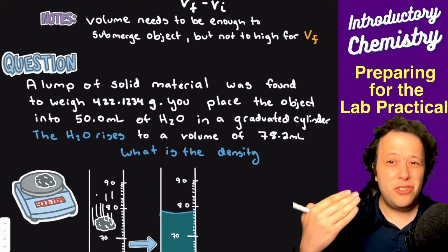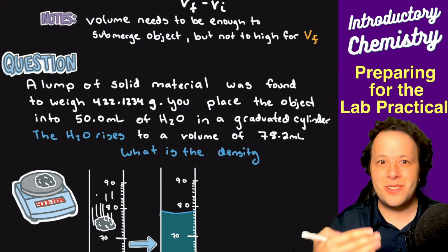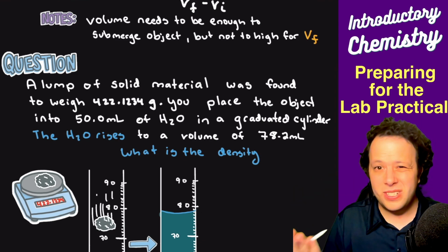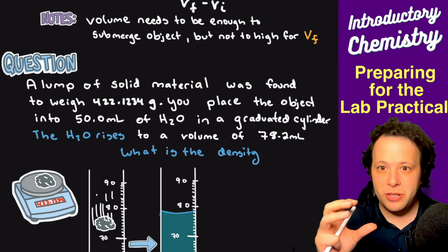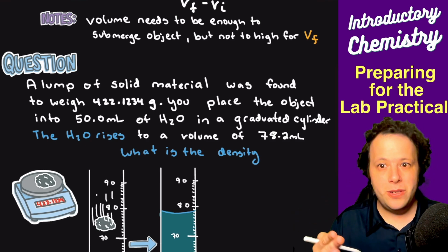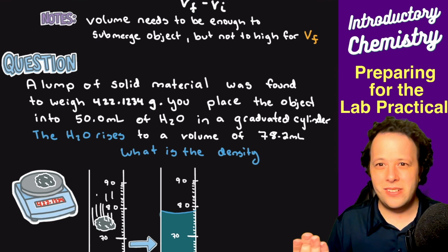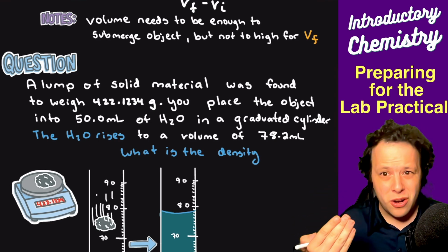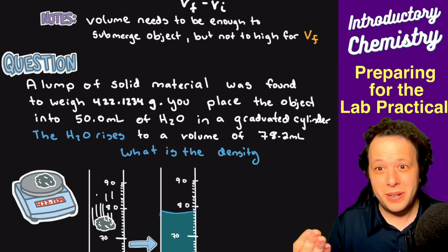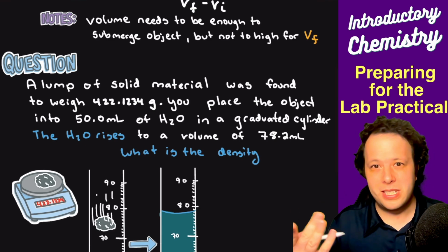This is something that is doable in 4 minutes, right? For you to quickly fill a grad cylinder, maybe put something in it. This is doable. Same thing with measuring an object and calculating the volume. Keep in mind, the formulas would be given to you if you had a cylinder or a rectangle, but you still need to know what density is. That's something that probably wouldn't be given to you, because you should know it because you've been using it pretty much for most of the semester.